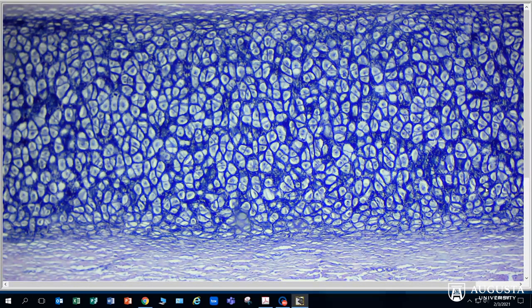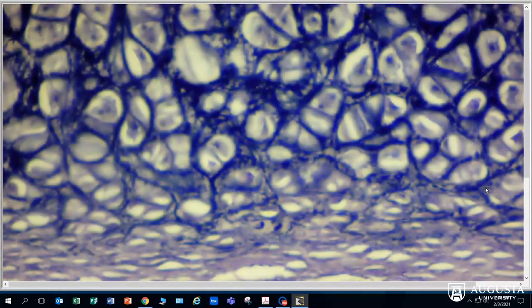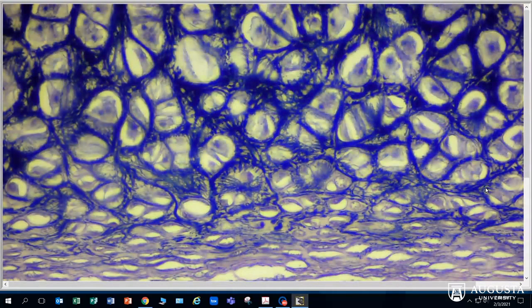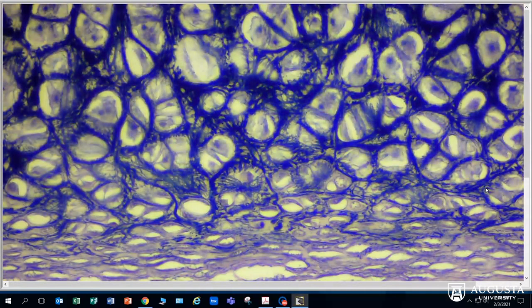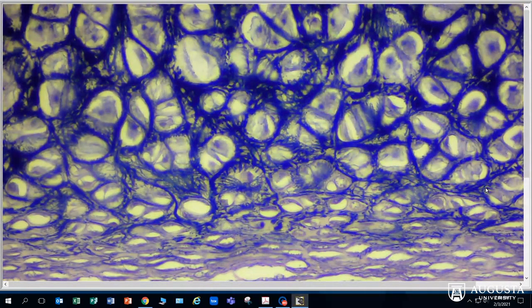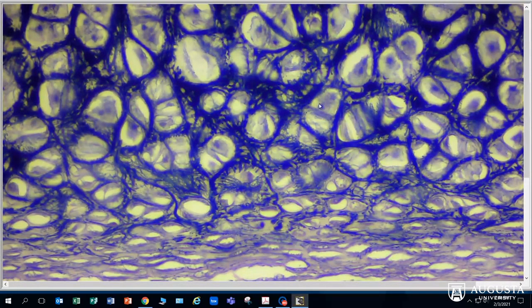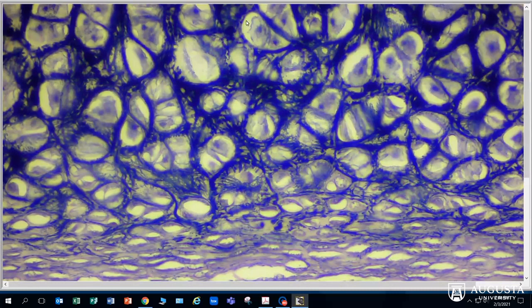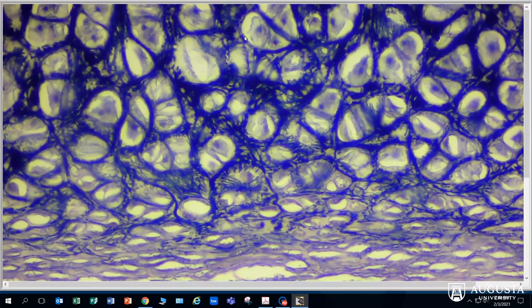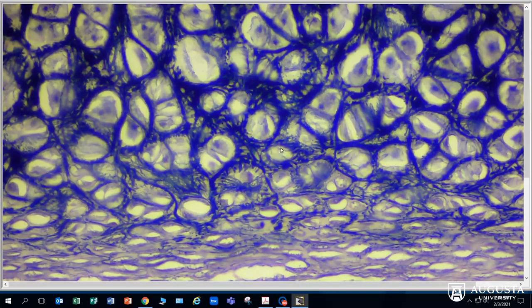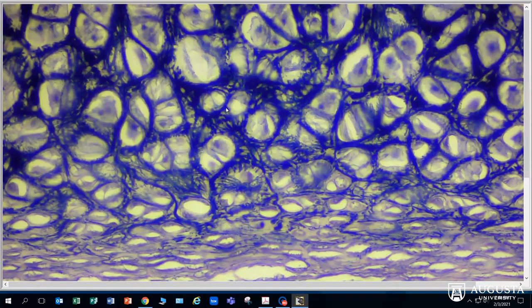If we look at this tissue with the 40x objective, we see that we have lacuna, chondrocytes sitting in the lacuna. Here's a beautiful chondrocyte, and this open space here is the lacuna. Between these chondrocytes in lacuna we have a lot of really dark fibers.